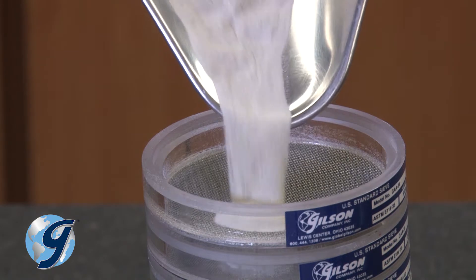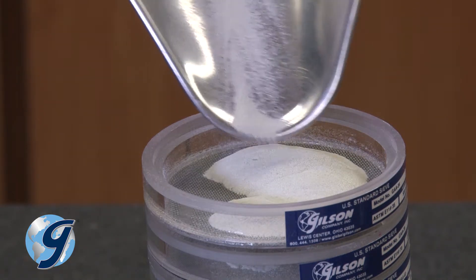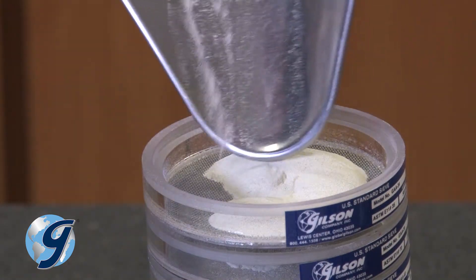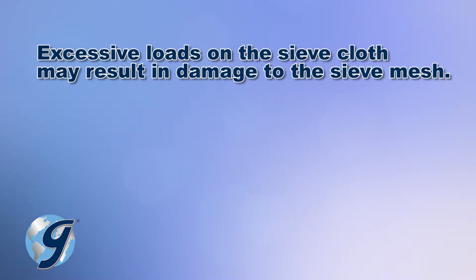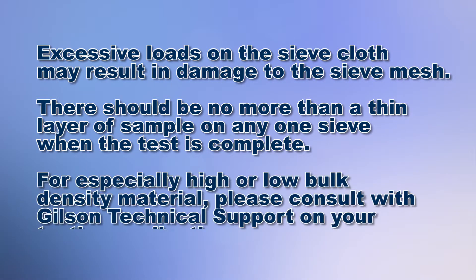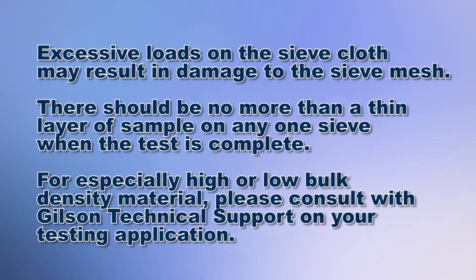Next, carefully deposit the sample onto the top sieve. Note that excessive loads on sieve cloth may result in damage to the sieve mesh. For proper separations, there should be no more than a thin layer of sample on any one sieve when the test is complete. If your material has especially high or low bulk density, please consult your Gilson technical support representative on your testing application.